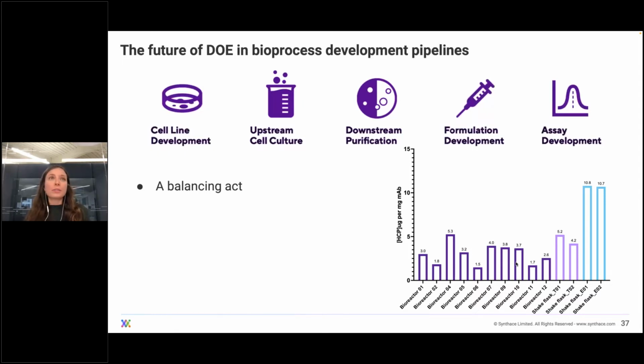So I would like to encourage you to maybe think about applying DOE in a more holistic way, where you consider all of the different factors from across the different areas in a single DOE design, to make sure that you have a more overview approach to your process.